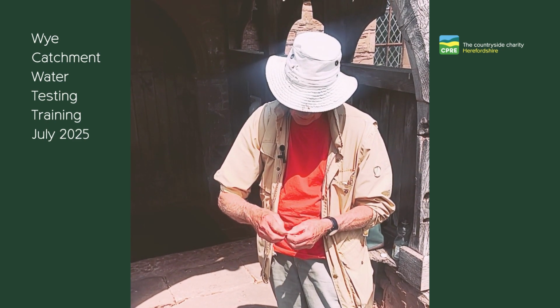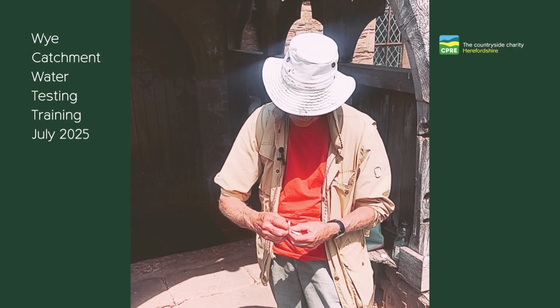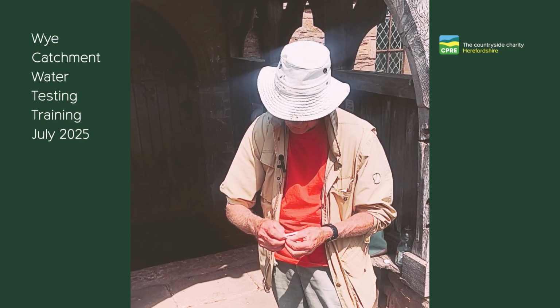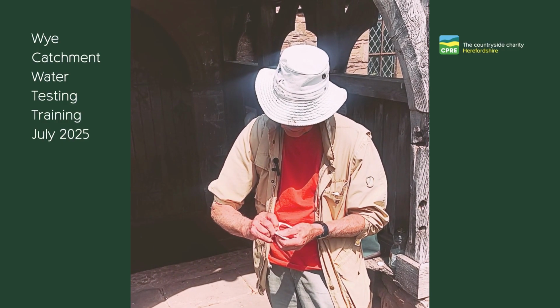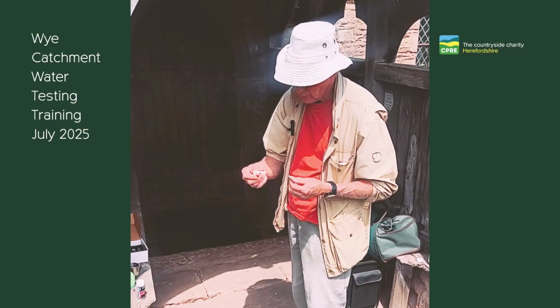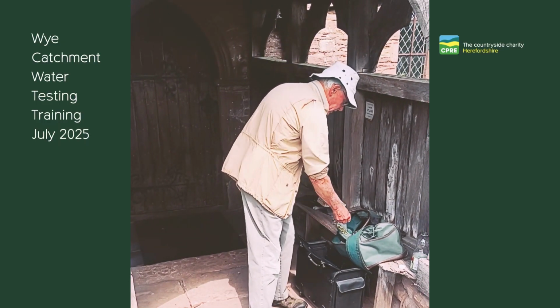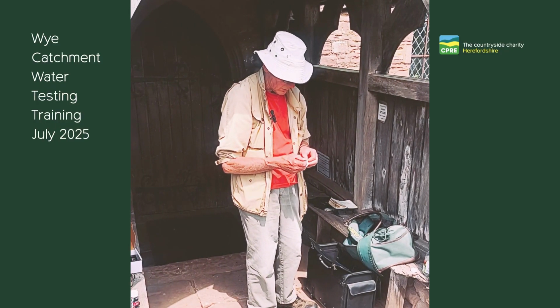So we've shaken that down, so now we tear off the edge along the dotted line. You can use scissors for this, but it's perfectly easy to do it simply by tearing it, as I'm doing now. Okay, so it's important to dispose carefully of your debris, and I usually just put it back in my bag and take it home and clear it out from time to time.